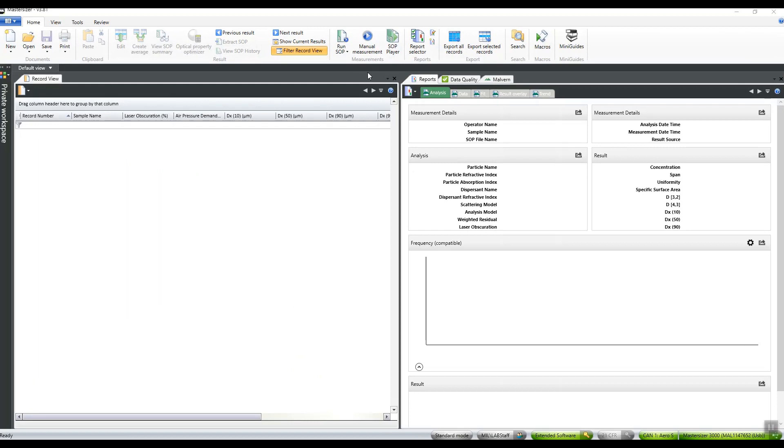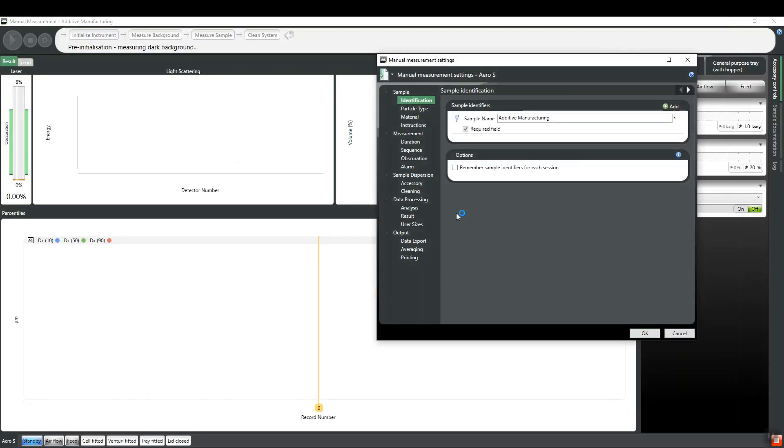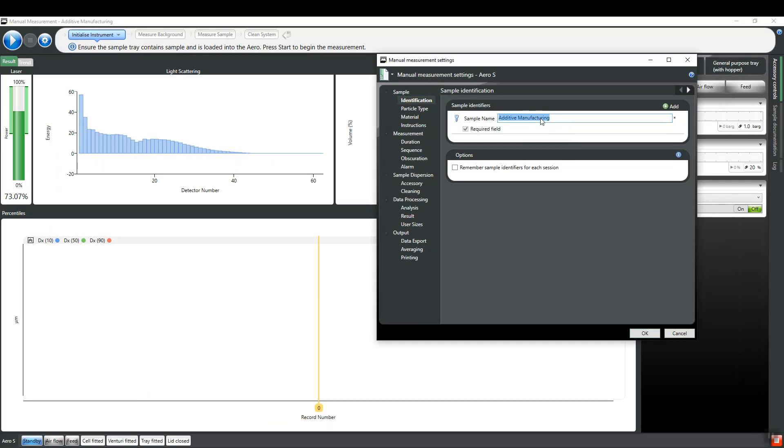We can then proceed to set up our measurement using either a manually controlled measurement or a more automated SOP. Here we are using a manual measurement, which allows us to define our measurement settings before initialization by proceeding through the settings manager.